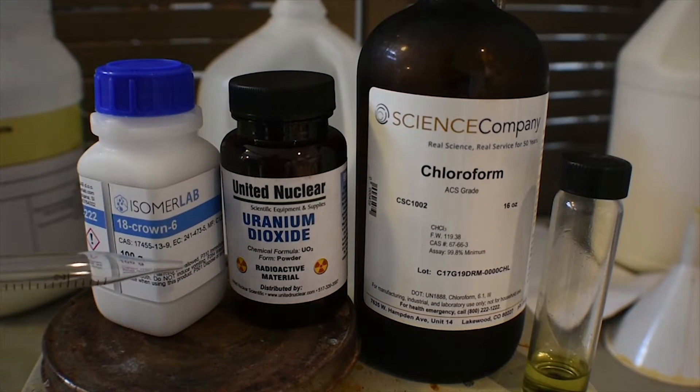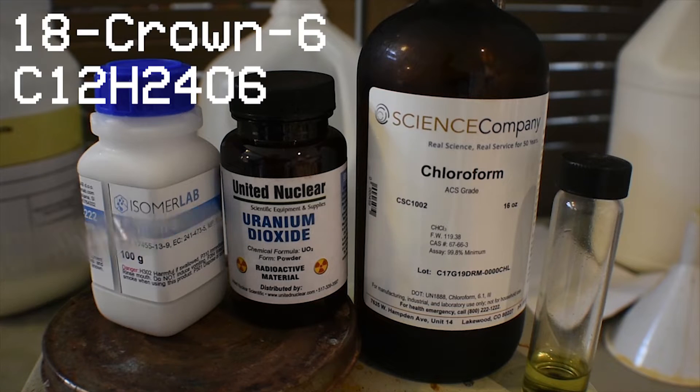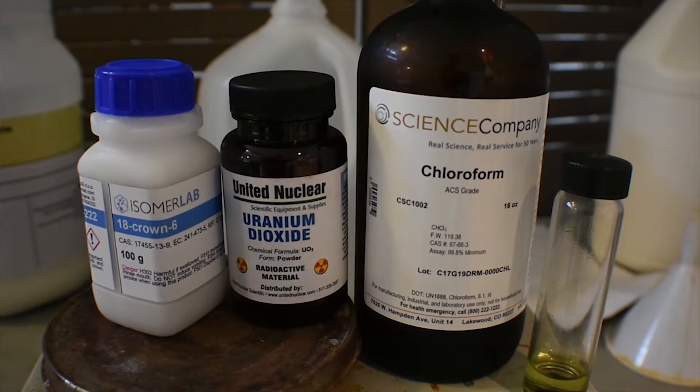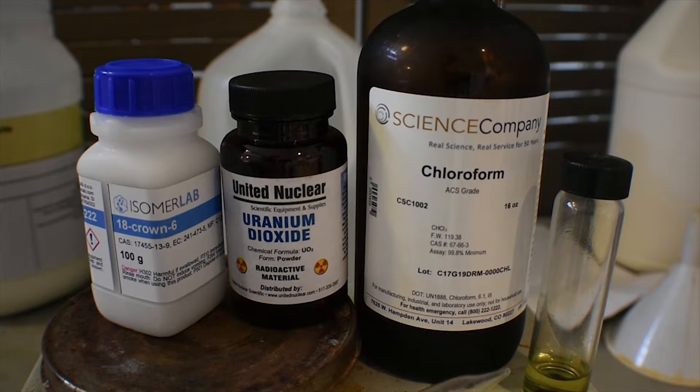Now you may be looking at this bottle on the left here. This is 18-crown-6. 18-crown-6 is a cyclic ether. Today we're going to be binding it with uranium(VI) in the form of uranyl nitrate.